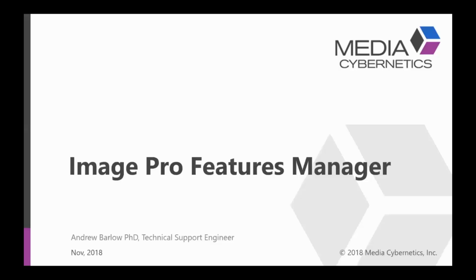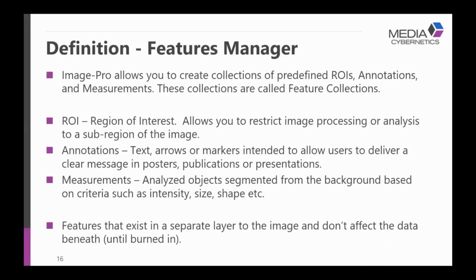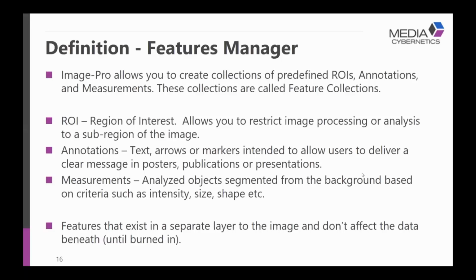Okay, so now I'm going to move on and discuss the Image Pro Features Manager. Image Pro allows you to create collections of predefined ROIs, annotations, and measurements. These collections are called feature collections. So let's just go through what each one of these types of features are.